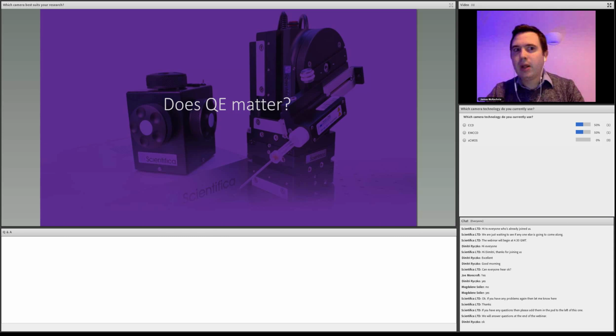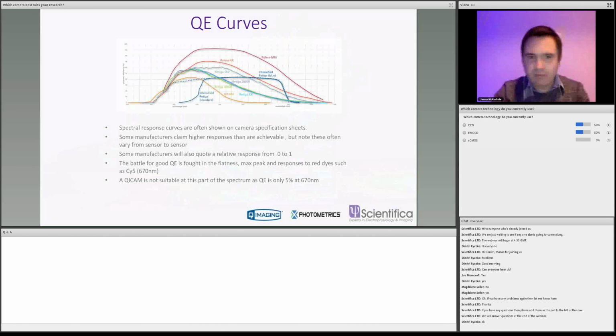It can often be a kind of false thing because it's very easy to visualize here. We have nice curves that show us, well, if we were to compare between, let's say, this camera and this camera, and these are quite old ones, but I think the situation still stands. This camera is, say, half the price of this camera. Well, that's a 10% change in QE there.